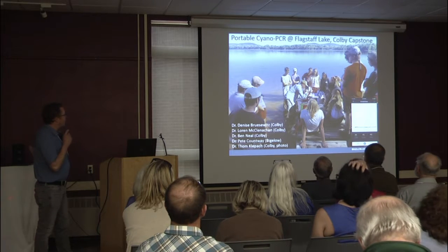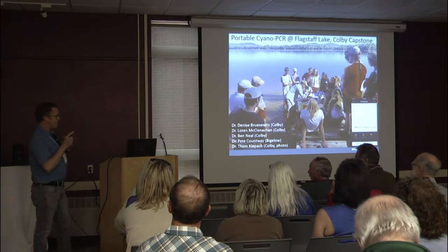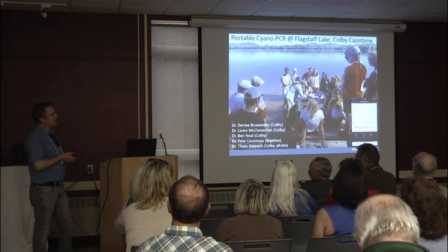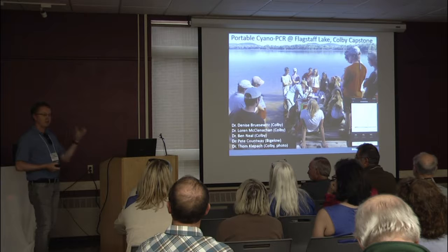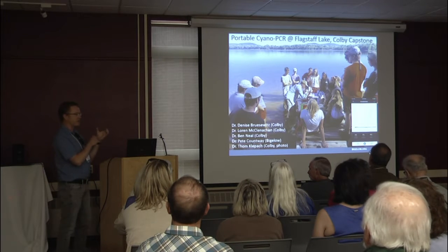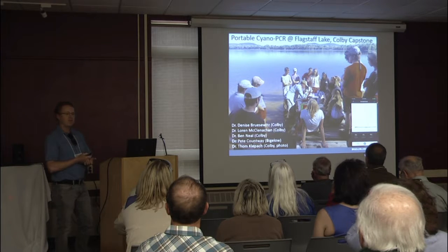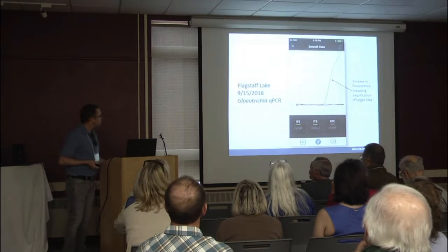If anybody wants to, they can talk to my son, who's a recent graduate of 7th grade. I demonstrated this technology in his class a few weeks ago, and the kids seemed to understand it. They could relate to the app. It's a simple matter of programming the cycling, and then even the DNA extraction is a 5-minute protocol that I could train all of you on in about 10 minutes.